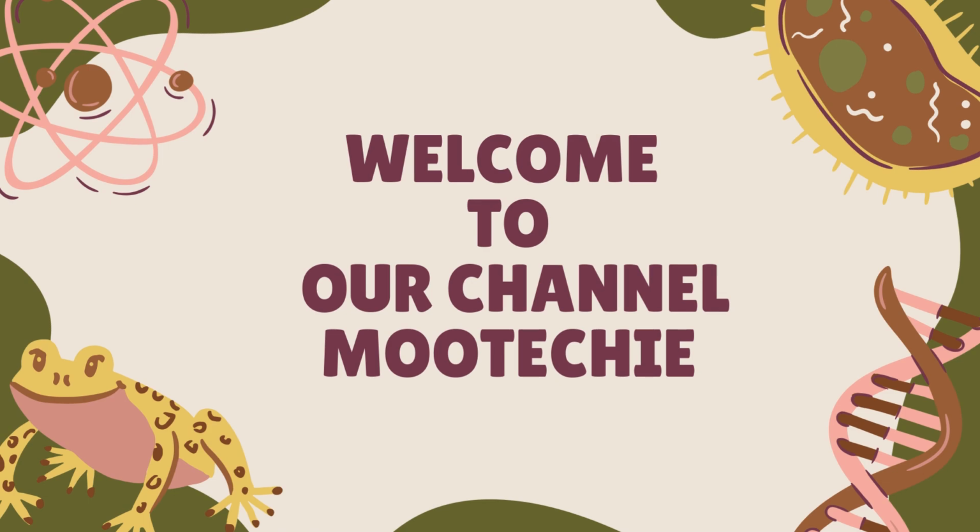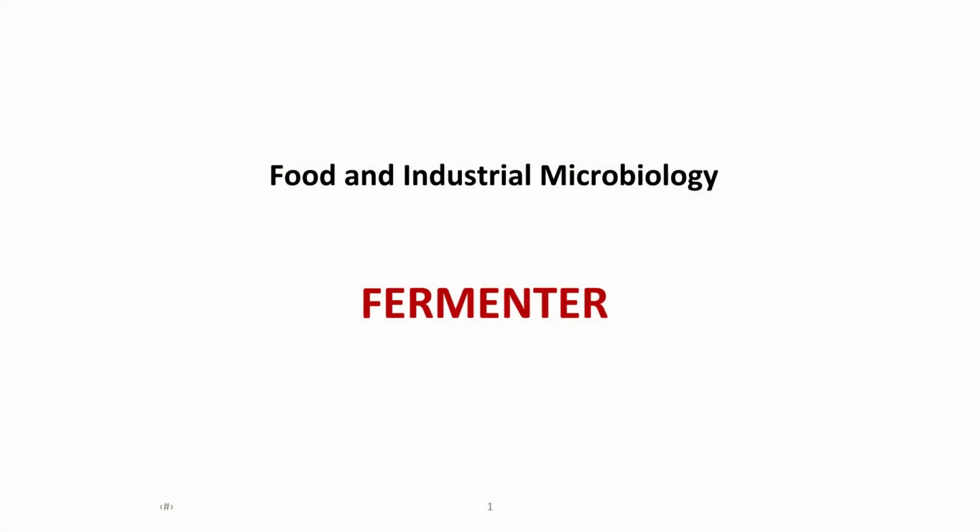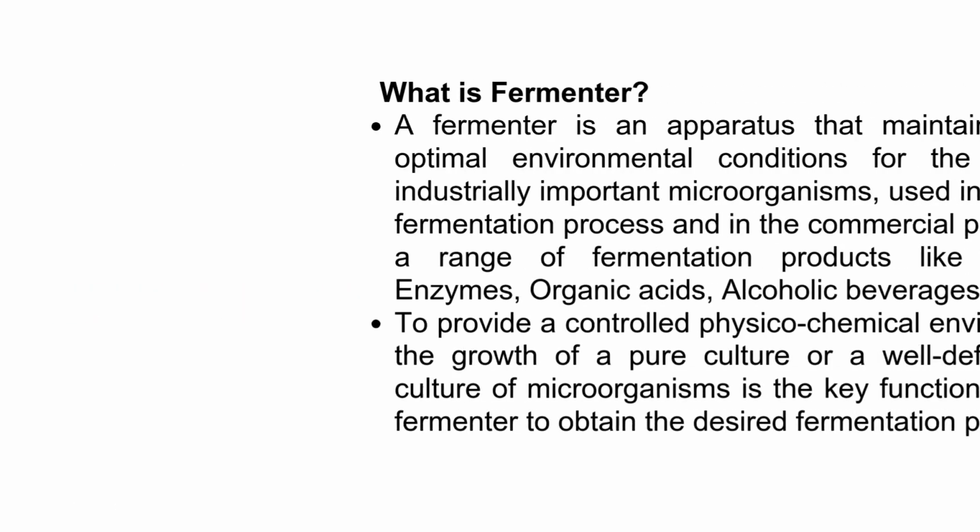Today we're diving into the fascinating world of food and industrial microbiology, with a special focus on a key piece of equipment, the fermenter. Let's begin by understanding what a fermenter is.